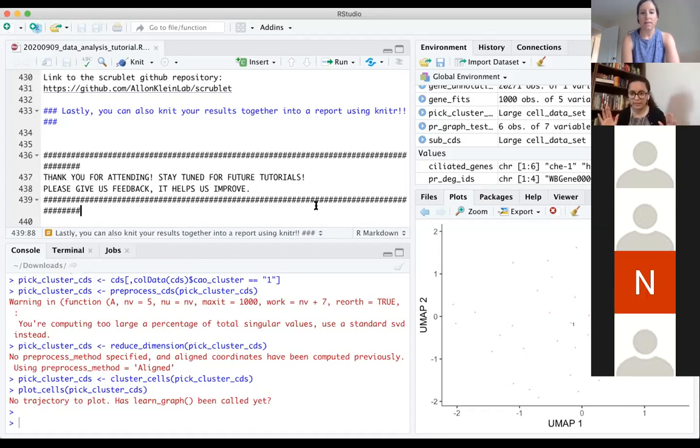So a very simple explanation is, if your data has cases and controls, so you're comparing A versus B, then regression analysis with the fit models function is the most helpful. It can also be a healthy patient versus cancer patient, or control versus drug treatment. So when you have basically A versus B, that's when you would want to use regression analysis.